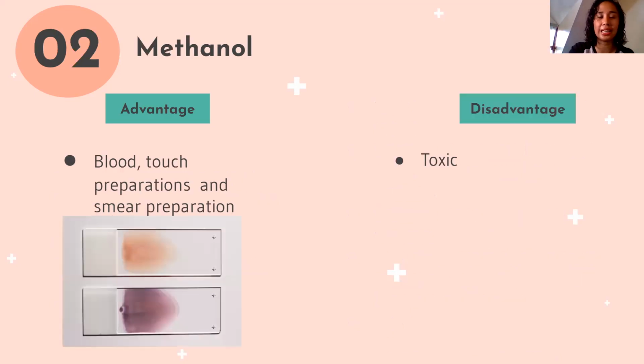Next, methanol, dali lang. So, wood alcohol. Nakakalason tong, yung ethanol ginagawang alak, class. Methanol talagang nakakalason to. It's toxic. It's good for blood, touch preparation, tissue film preparation. Mga maninipis lang. Touch preparation, yung in-stamp mo or in-imprint mo lang yung tissue sa slide.